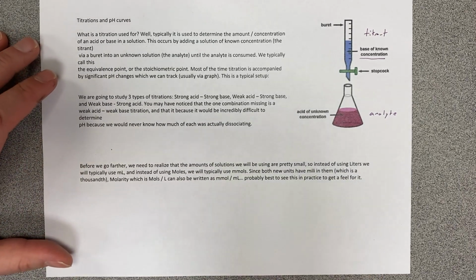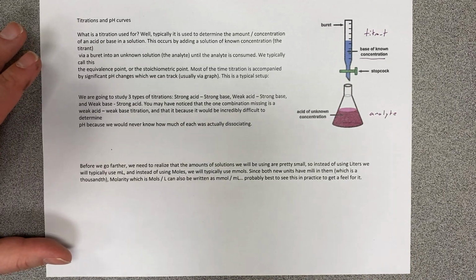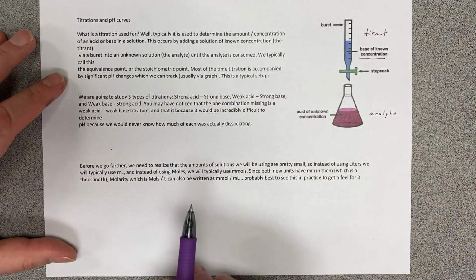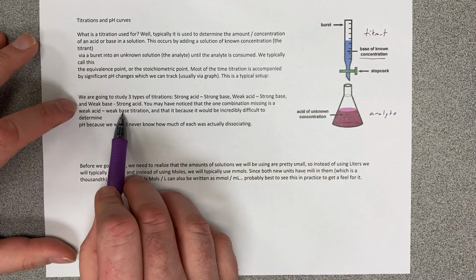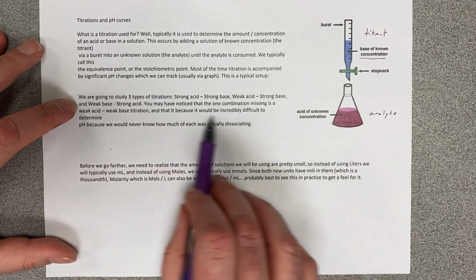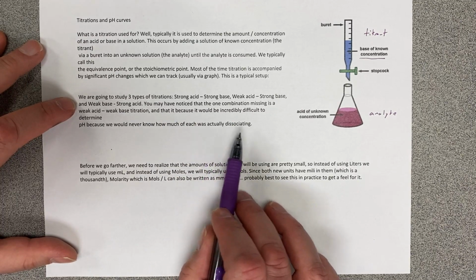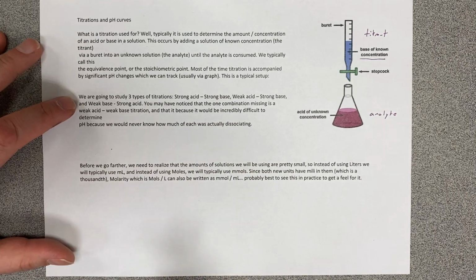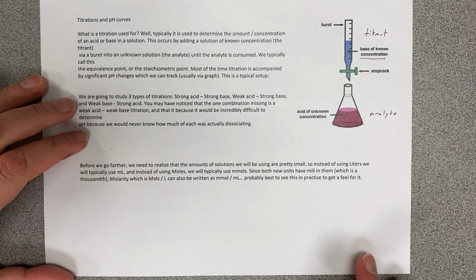Now, there are three different types of titrations that we're going to focus on. There's actually four, but we're not going to focus on one right now. One's called an oxidation reduction, so wipe that from your brain. We're not going to deal with that. But we have a strong acid, strong base, a weak acid, strong base, and a weak base, strong acid. Of the different permutations, the one that we're not going to be working on is the weak acid, weak base titration, because that would be a nightmare mathematically. So we are going to jump into showing you how to do a titration with a strong acid and a strong base.